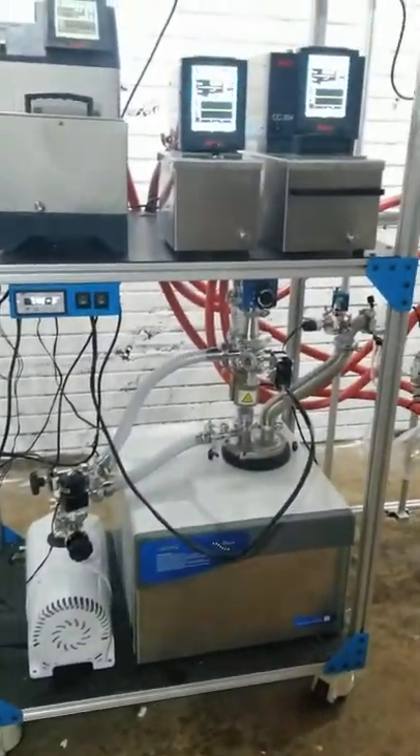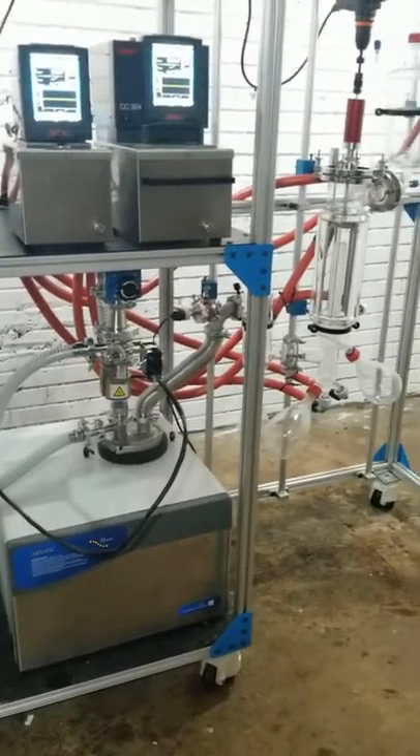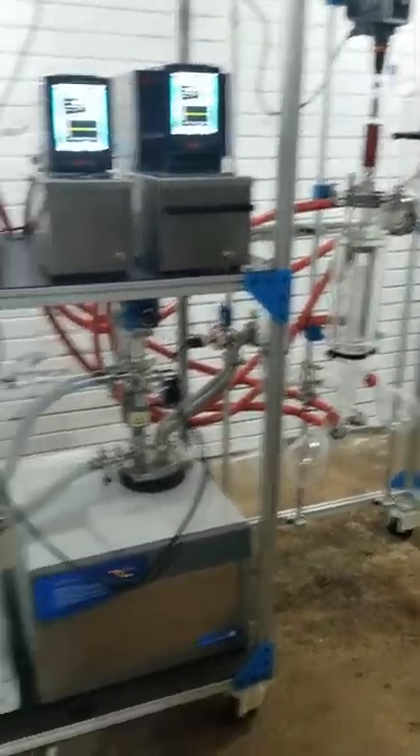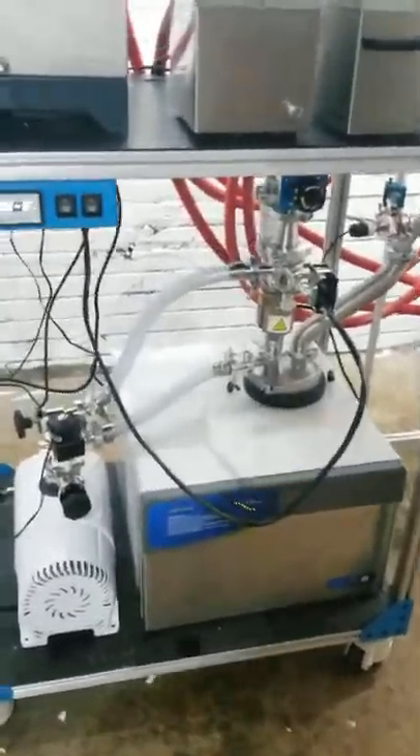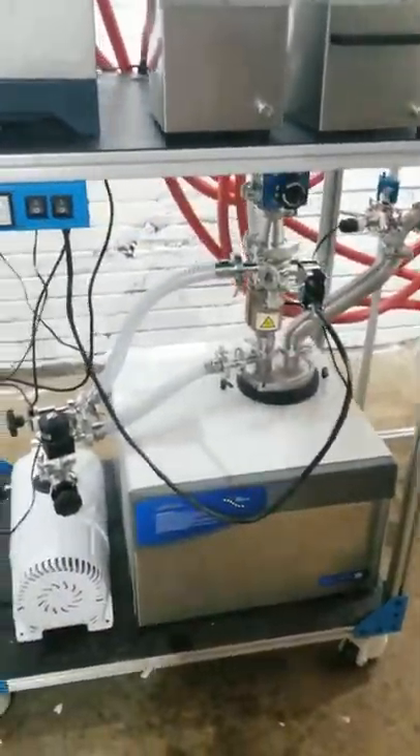I'm down here in Mexico. This is Jacqueline, and I set up this awesome PurePath system from Cascade. This baby has a diffusion pump, so I wanted to make a short video just showing how to operate a Cascade diffusion pump and also diffusion pumps in general. Let's check out the components.